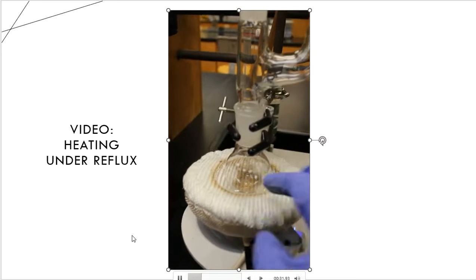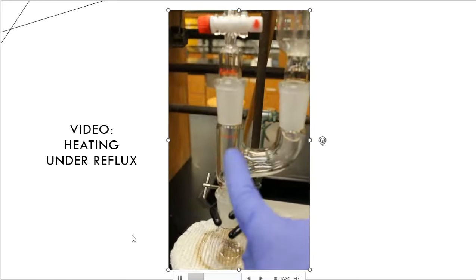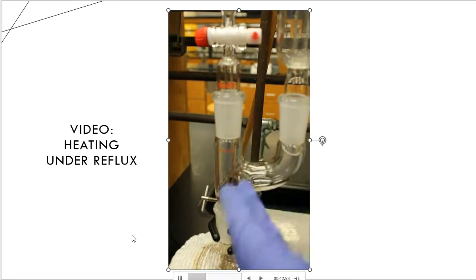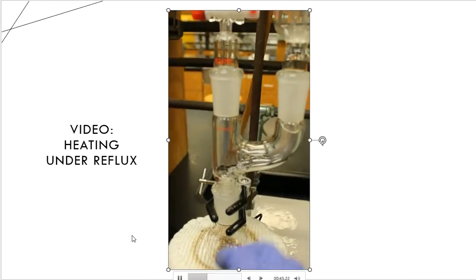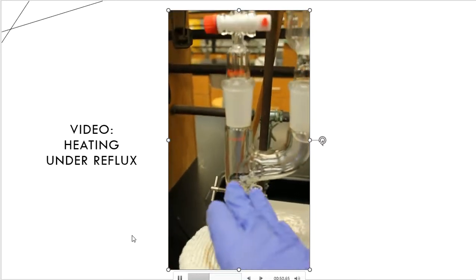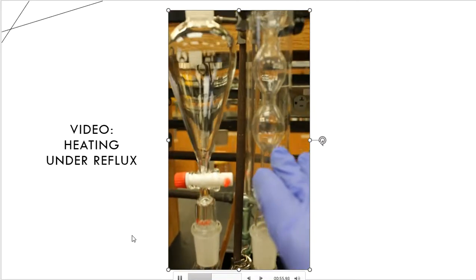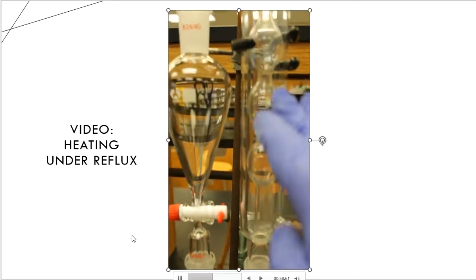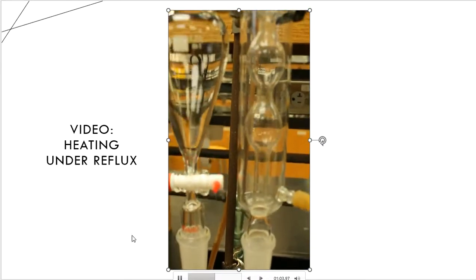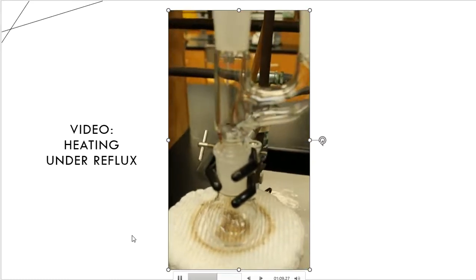Here I have a boiling flask that all of my reagents will eventually go into. And then I have an adapter here. We call it a U adapter, and that basically routes this thing into two different directions. So this is going to get heated up. Some gas is going to kind of evolve. Things are going to evaporate. Those vapors and fumes are going to rise up, and then they're going to go into this part of the U adapter and up into this right-hand piece, which is called the condenser. So the condenser is going to condense, that's why we call it the condenser, those fumes back down into a liquid so it can go back down into the boiling flask. We do not want to lose anything.